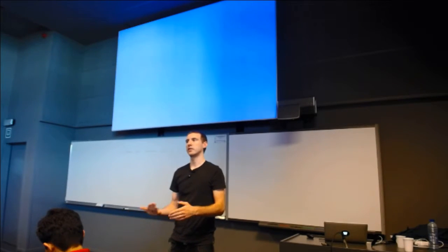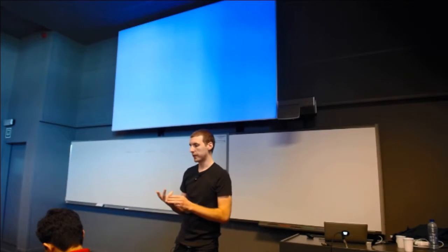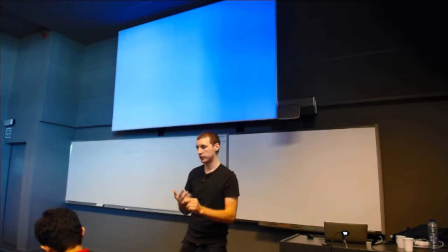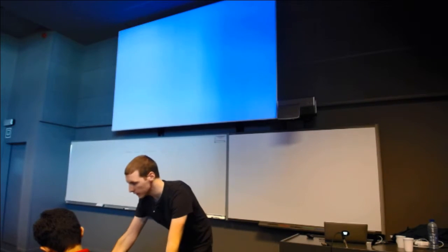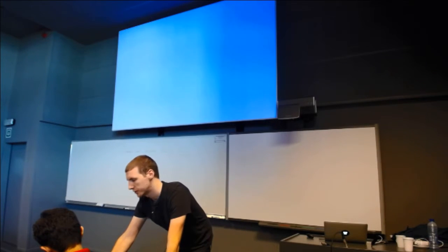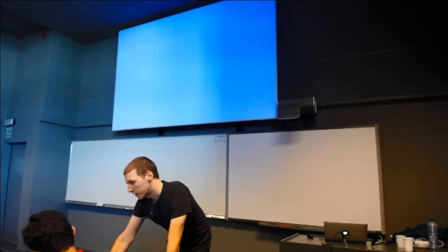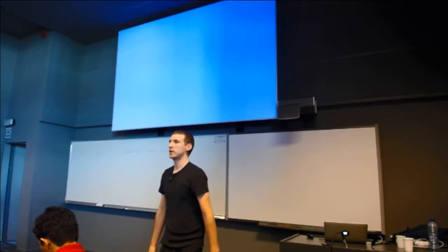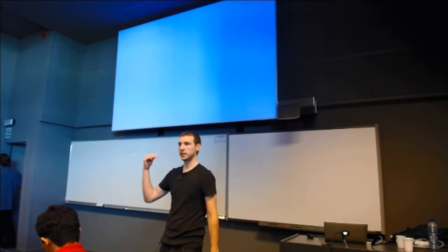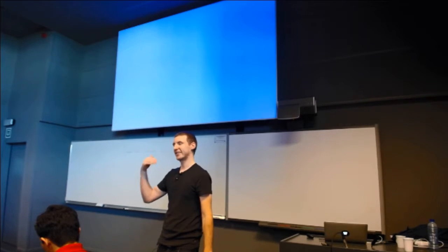You simply state it as two, in the applied assay section. You state it as two technical replicates, so you then have two different technical replicates to assign sequencing to. Yes, so in the CSV it has the same biosample internal ID number, the same applied assay number, but a different technical replicate internal ID number, and therefore also a different sequencing internal ID number.